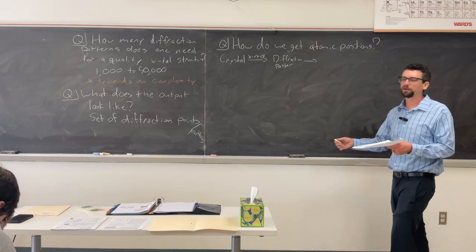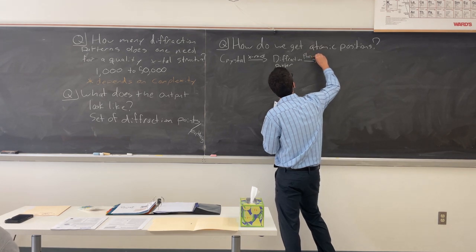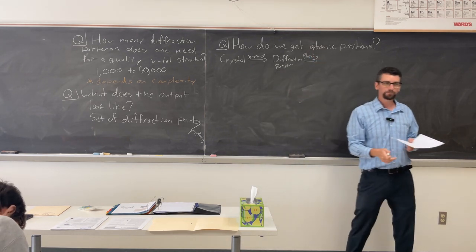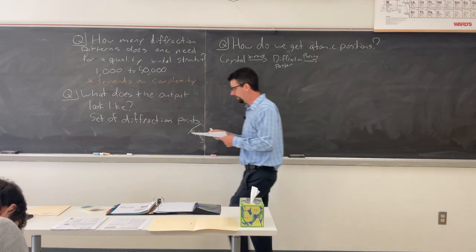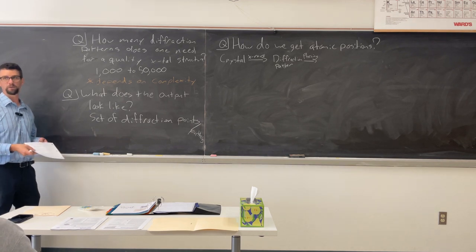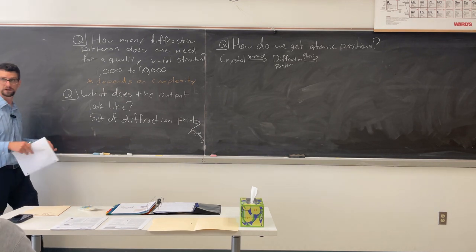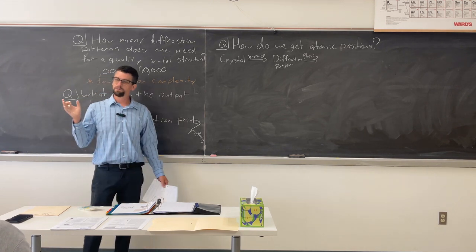What we do next is something called phasing, which has to deal with what you're learning about in modern. You do Fourier transforms, which are real fun. I'm contemplating whether we're going to actually conduct a Fourier transform or not. And then we move to something more chemical.